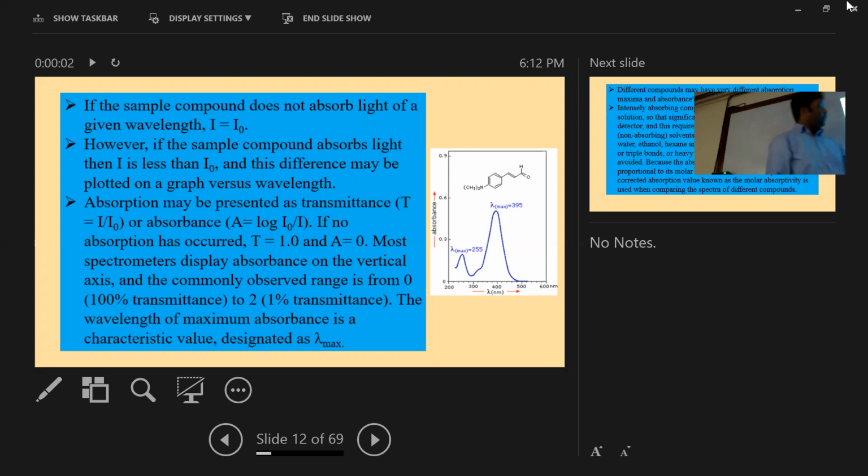That will be different for different molecules. For water, that will be one. For mango juice, that will be different. For orange juice, another. For gold nanoparticle, it will be another. I remember the exact value for gold nanoparticle: if the size of the nanoparticle is around 10 nanometer, then it will absorb at 520 nanometer, because I worked on that particle, so I can remember it easily.